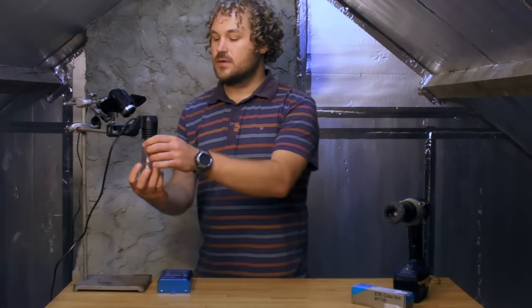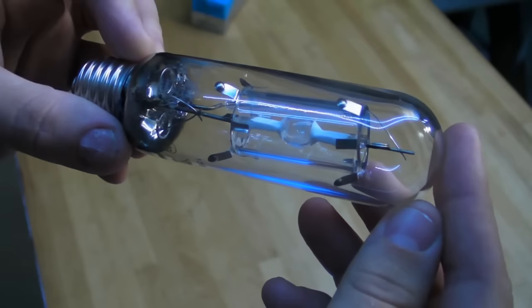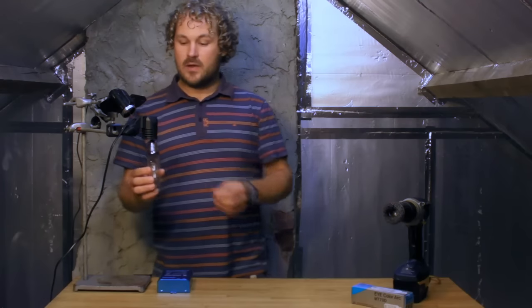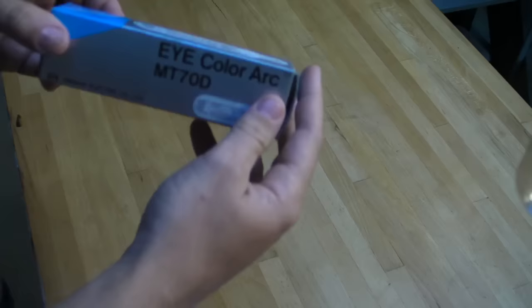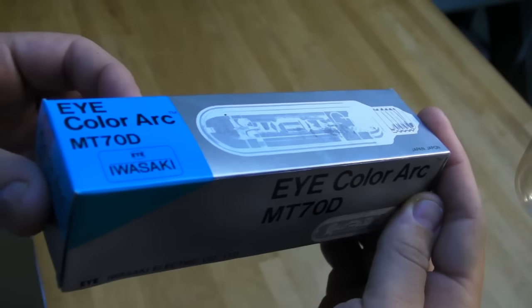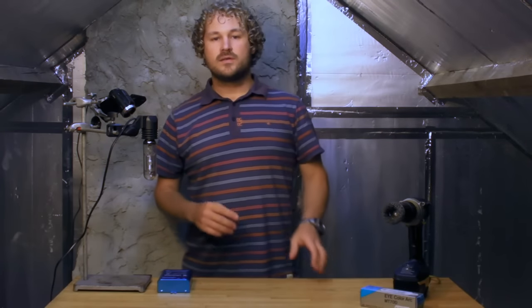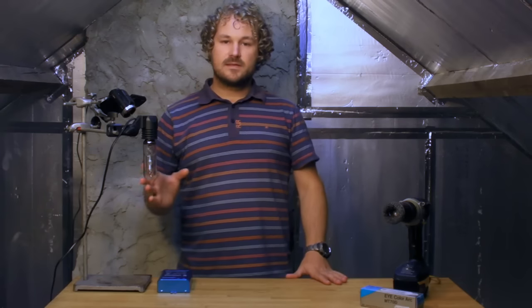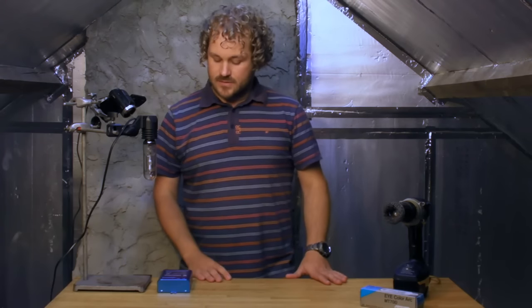A good light source for use in the darkroom that we like is this Iwasaki iColor arc lamp. Now, arc lamps are again quite spiky light sources, but this one's not too bad. It's been designed to try and recreate D65 lighting conditions. That's the standard lighting conditions that you might typically find on a sunny day in the shade. So this light is very good at recreating light similar to the sun.